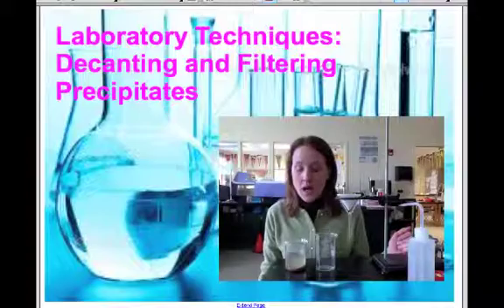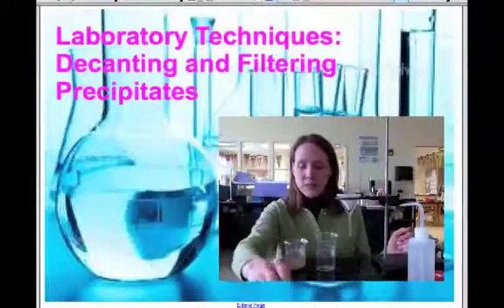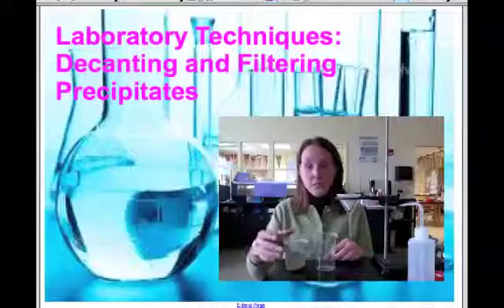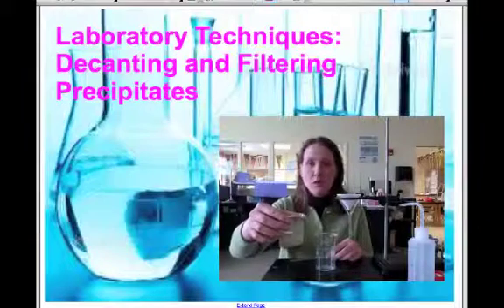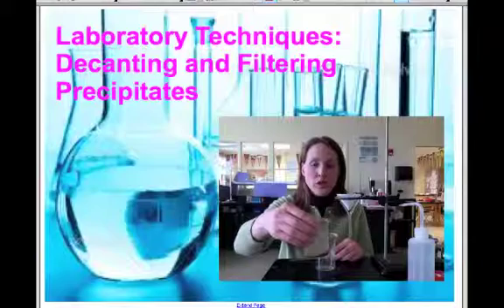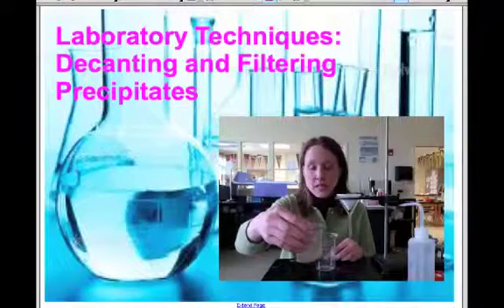And I will be just separating out some sand for you today. So it's not nearly so pretty or interesting, but it serves the purpose. So first, the first step in this process, here I have some sand at the bottom of a mixture with water. And I'm going to just gently swirl it in order to dislodge some of the particles from the side of the glass and to rinse the precipitate.